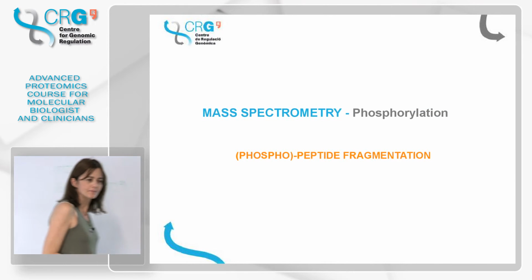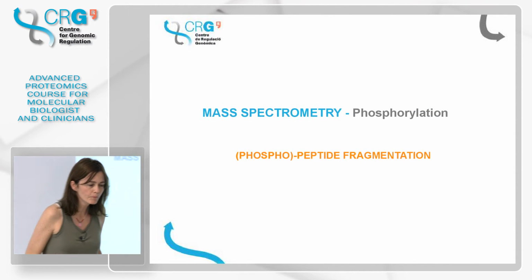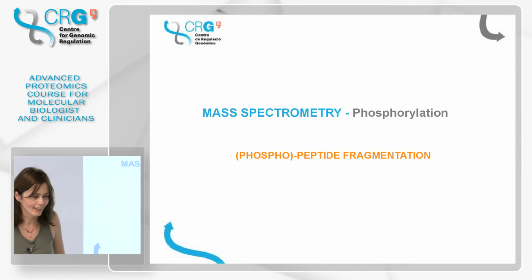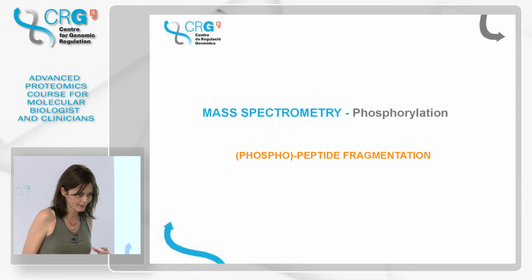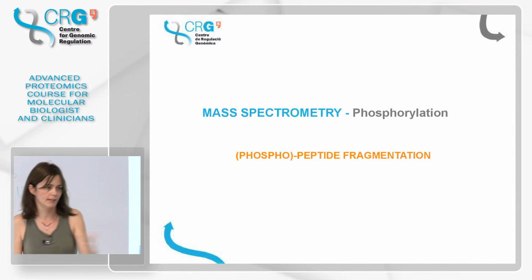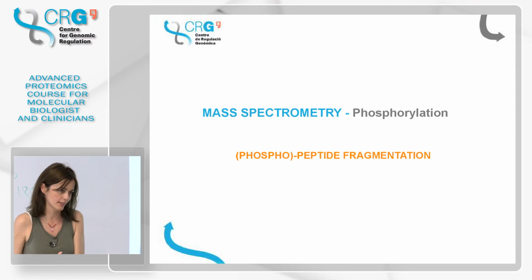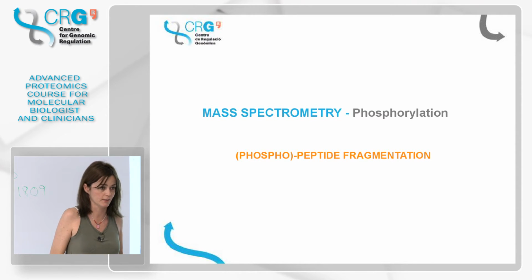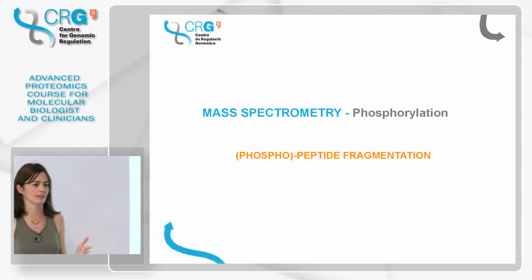Sorry, a question. Yes. Are the phosphates stable in the phosphopeptides? They are quite stable, but this is another issue. They are stable up to a point. People in general like to enrich and analyze quite fast. It's like asking how stable a peptide is in the freezer. In general, pretty stable, but phosphopeptides, even less.